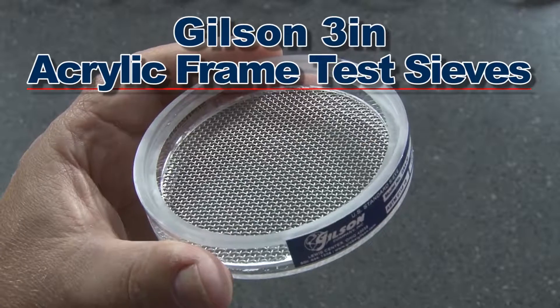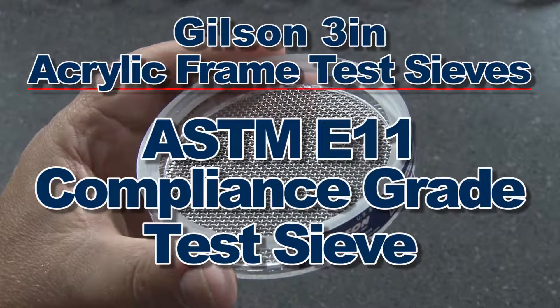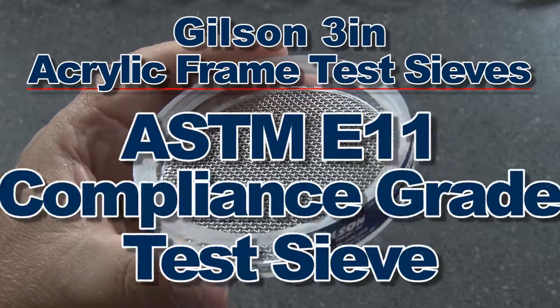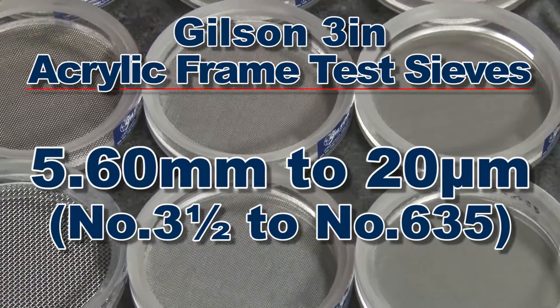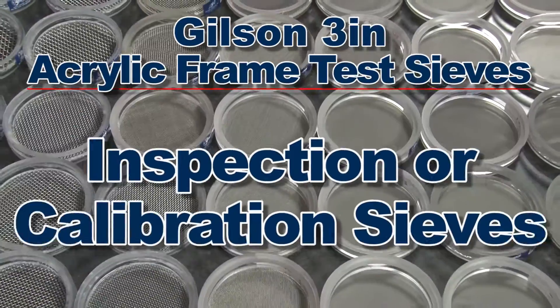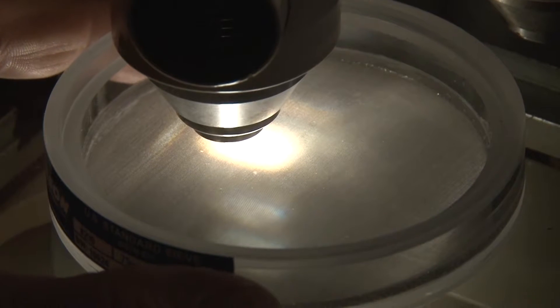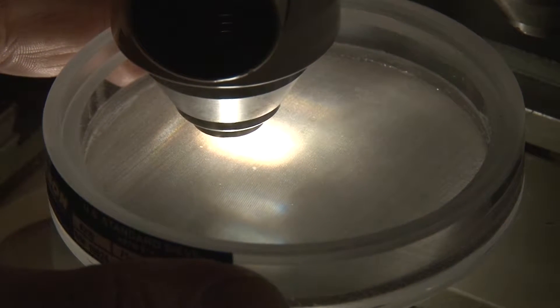The 3 inch acrylic frame test sieves meet ASTM E11 requirements for compliance test sieves and are available in sizes from 5.6 millimeters to 20 microns, and are also available as inspection or calibration sieves using Gilson's verification services.